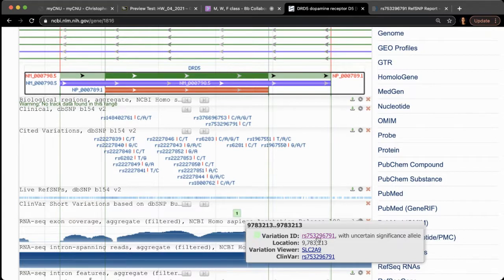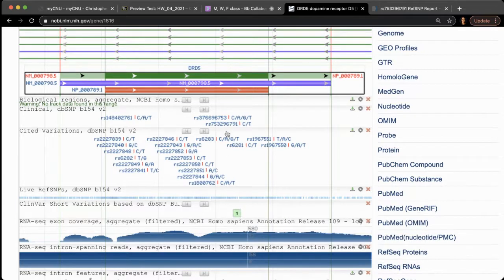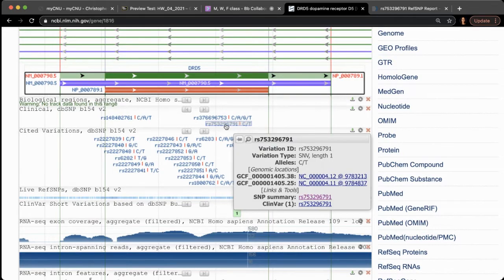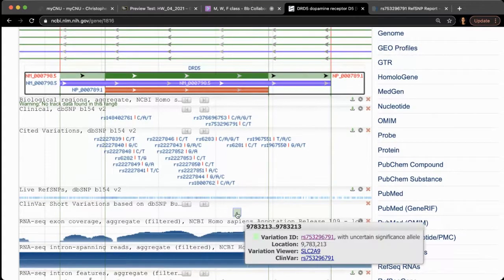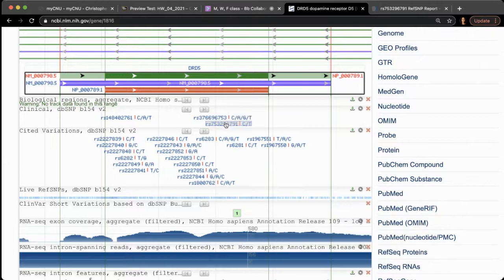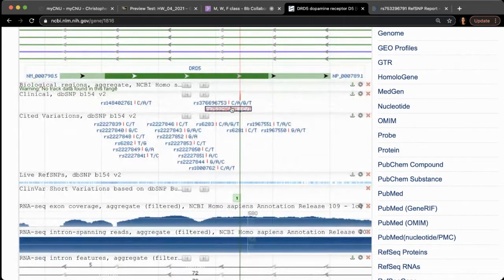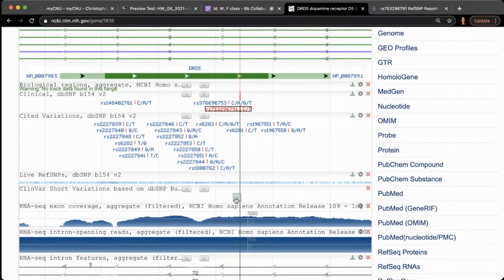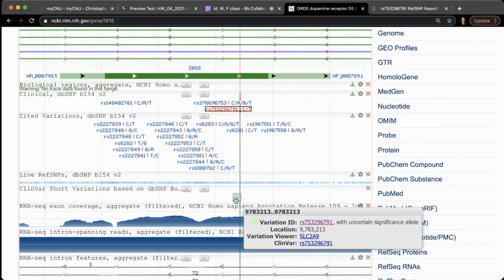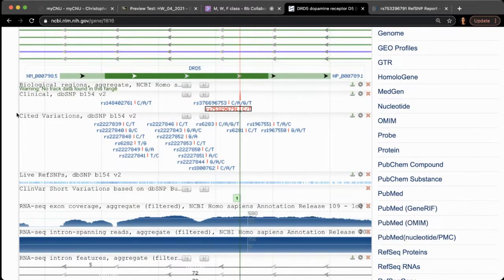Yeah, so this is the same as this. But in this view here, it doesn't look special, right? And then in this view here, you'll be able to click on it and find more information. You could click on it here too, but it doesn't take you to the next screen. Or you can click on this, and that's going to end up in the same spot as if you clicked here. So there are different ways of going about it.